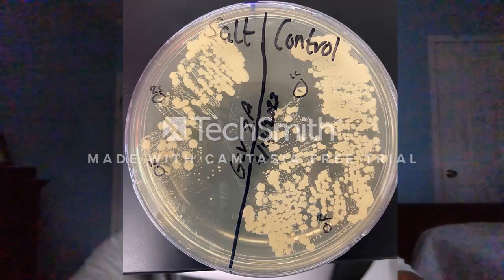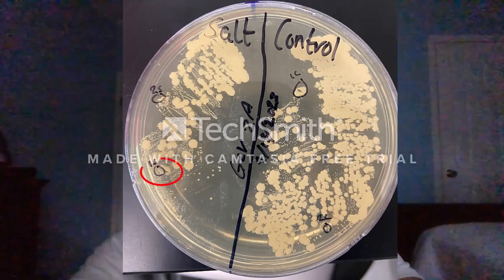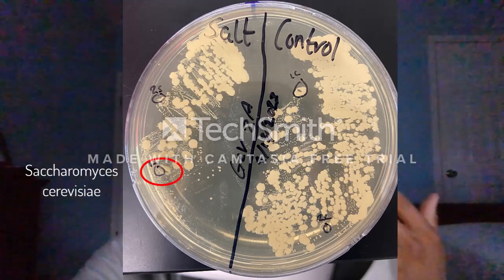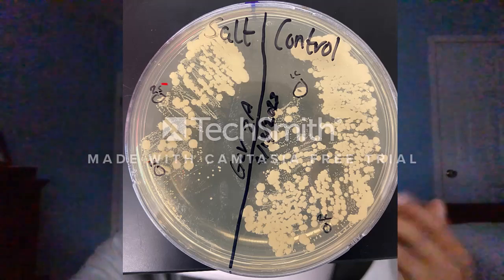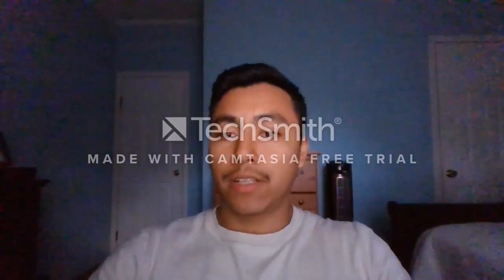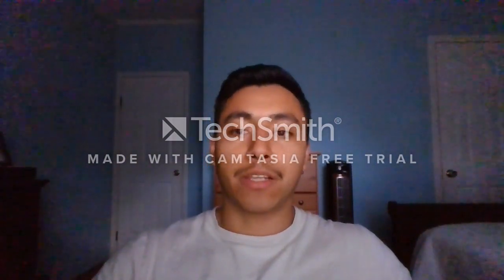These are the samples that were unsuccessfully sequenced. We believe the first unsequenced organism is Saccharomyces cerevisiae because the microbial colony looks like that of that organism, very small, round, and mildly isolated. We believe the second unsequenced organism is Staphylococcus capitis because the microbial colony looks like that of that organism, large dots and very condensed. After 2 weeks, the composition of the microbial community amongst each pair of plates has significantly decreased. The only organism that was successfully sequenced was Saccharomyces cerevisiae.